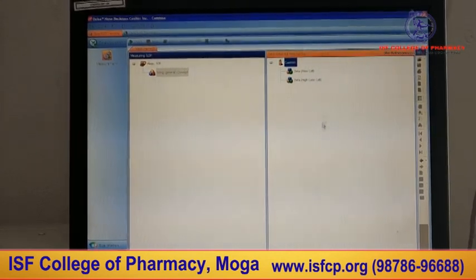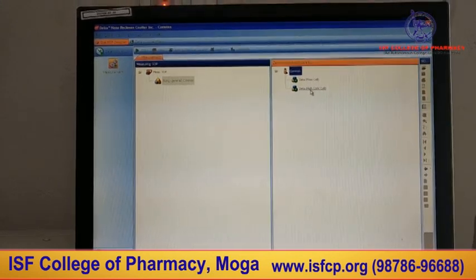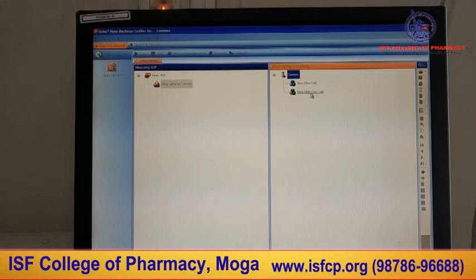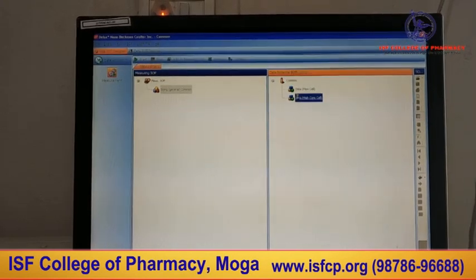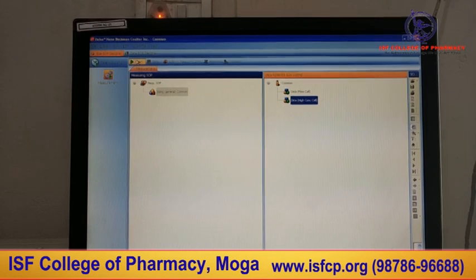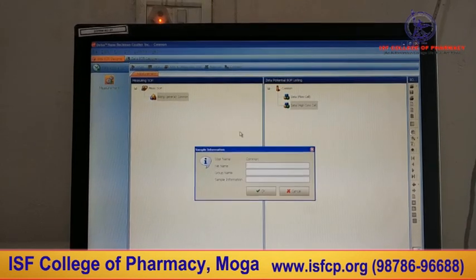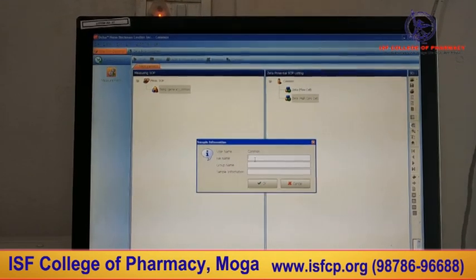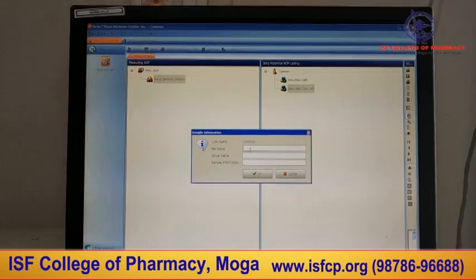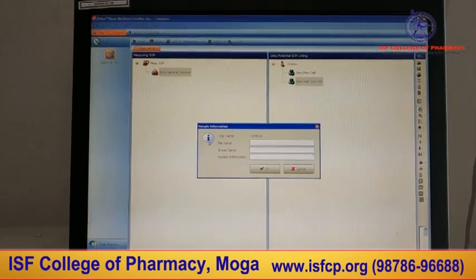You can see over here it is showing Zeta flow and Zeta high concentration cell. We can click over here and start our procedure. And once again we are going to keep any name, but when you perform the experiment you have to give your own name.